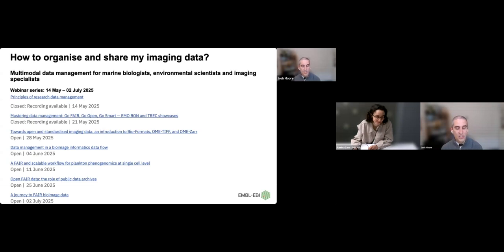So speaking of users at the other extreme, I was asked after giving a presentation like this by a senior PI, do I need to understand everything you just said? And the thing is, not necessarily. Obviously this webinar is about telling you the details and giving you what you need to communicate this to the rest of the community. A lot of what I showed would be completely in the background for a generic user, especially all the web tools. You can take the URLs and just send users to a URL and they can look at OME-Zarrs with zero idea about the chunk size.